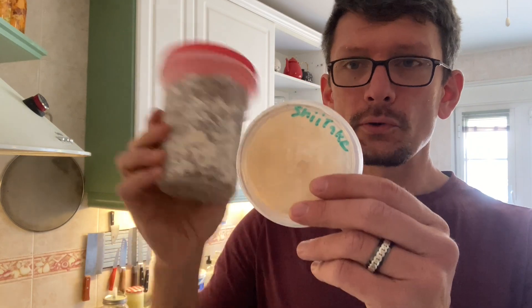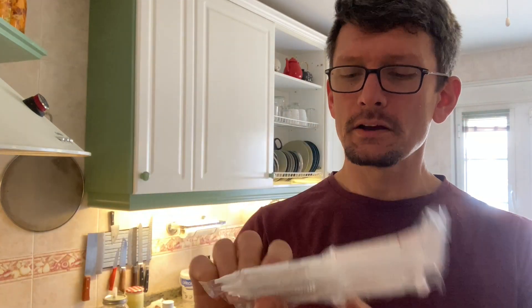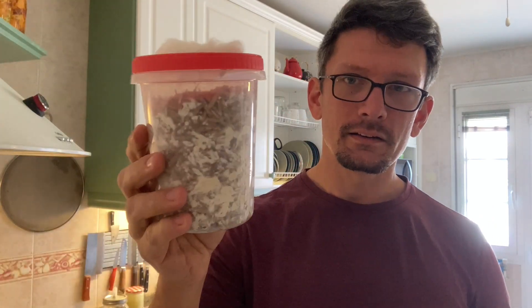Before you get to this you've got to get to this, and in order to get there it's helpful to buy liquid mycelium. Here I've got three different kinds and I'm going to expand it so I have several jars of liquid mycelium. I can use it to make slants for long-term storage, and I can use it to make agar which I can use to make grain spawn.